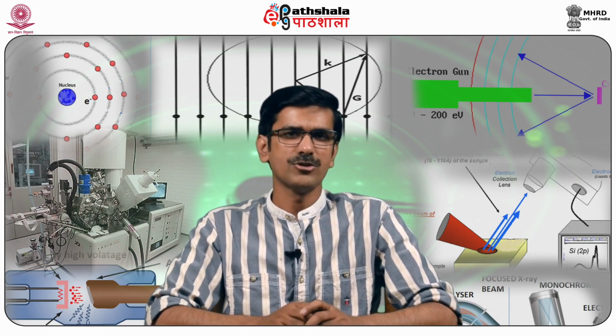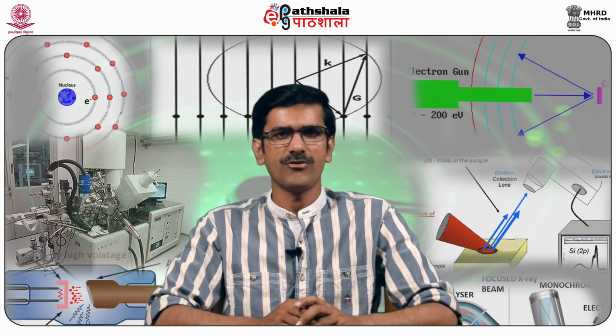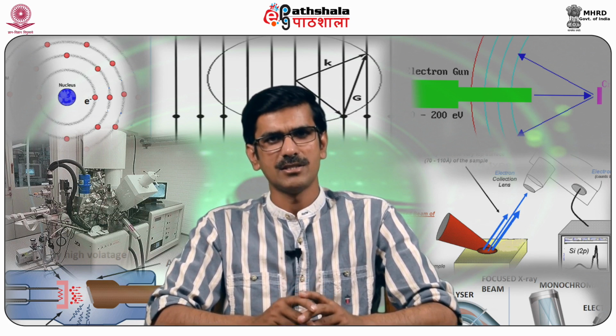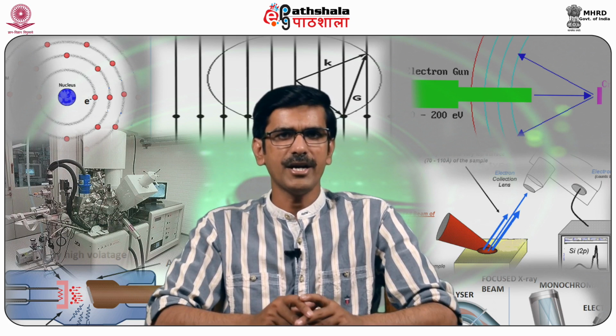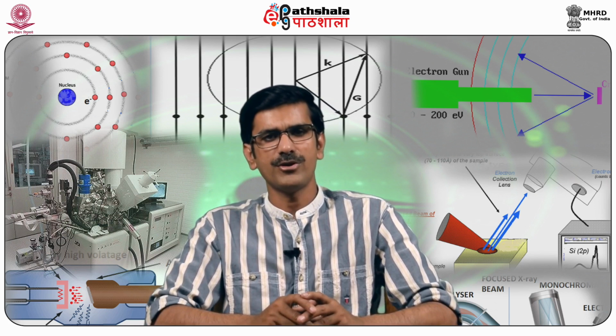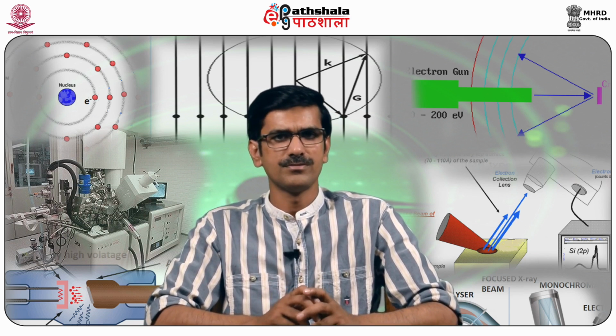Photoelectron spectroscopy, also known as PES or photoemission spectroscopy, refers to the energy measurements of electrons emitted from solids, liquids, or gases by the photoelectric effect. In order to determine the binding energies of electrons in a substance, the term refers to various techniques depending on whether the ionization energy is provided by an X-ray photon or an ultraviolet photon.